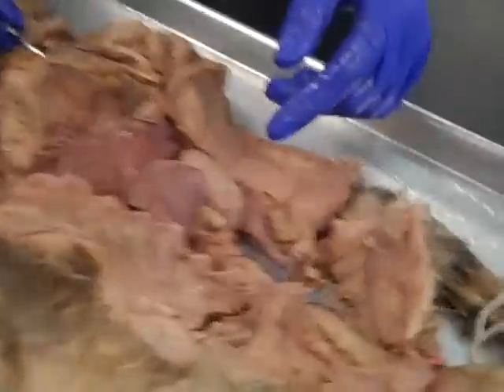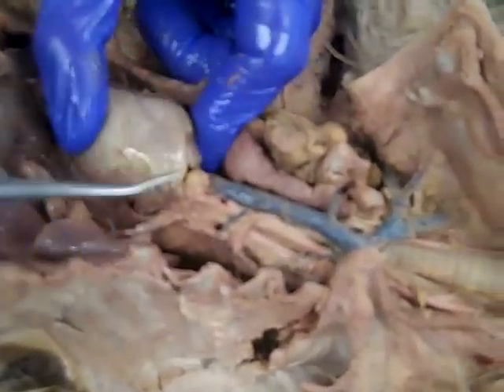Hey folks, we're going to do some more arteries and veins today. We're going to do the thoracic cavity. So let's go back to our cat and let's get in there. So we got our heart, got a very nice heart, kind of squishy in here.